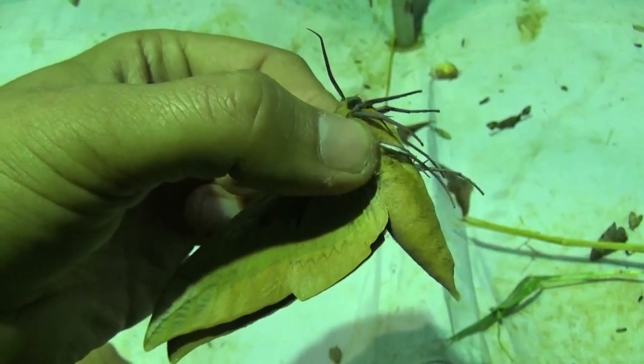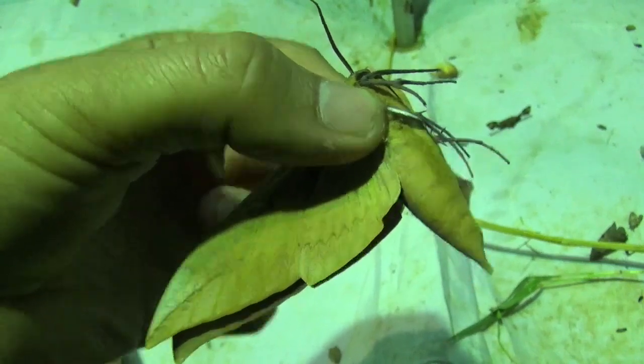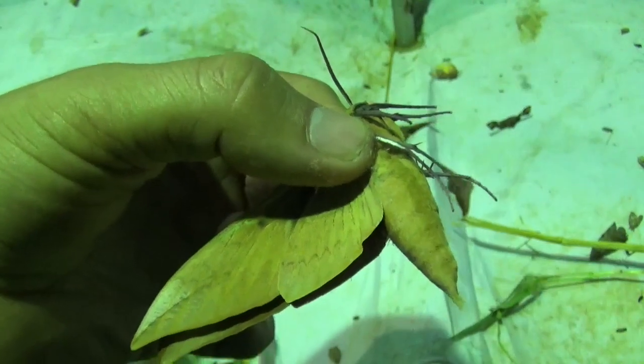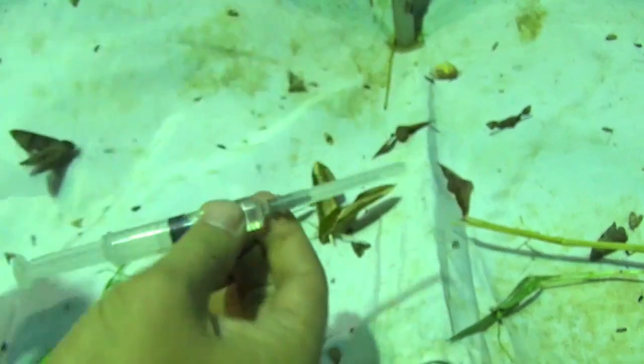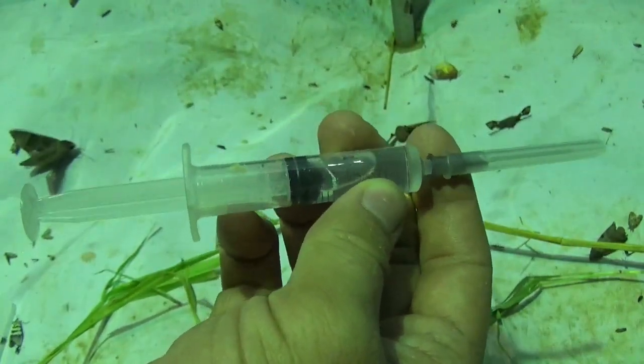Here in my hand I have one specimen of Clanis, a giant hawk moth. It's a little bit rare-ish, but not hard to find in most parts of tropical Asia. I am going to inject it with a killing agent, which is ethyl acetate.